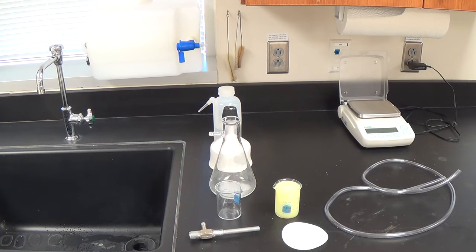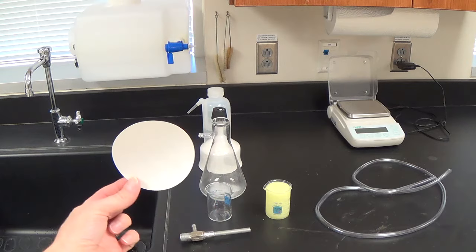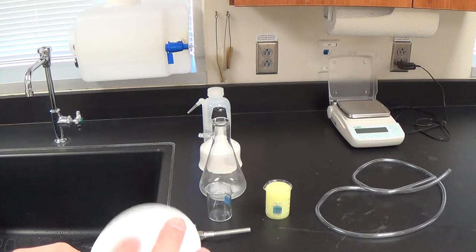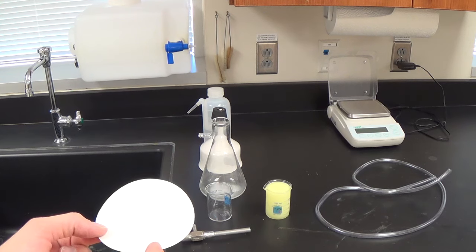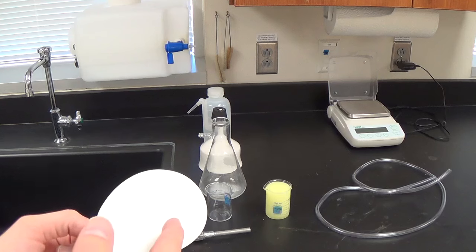To do gravimetric analysis, I need to know the mass of that precipitate. How can I get the precipitate out of there to find the mass of it? I hope you said filter it, because that would be correct. We have filter paper, yay! So I'm going to use the filter paper, I'm going to get solid on there, and I would mass it. Oh, wait a minute. If I put solid into my filter paper and I massed it, that would be the mass of the filter paper and the solid.